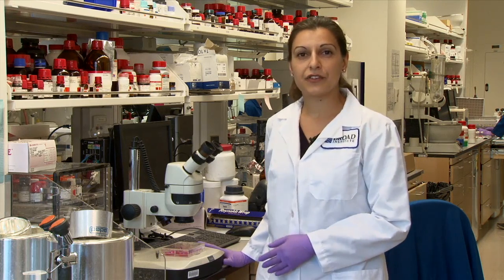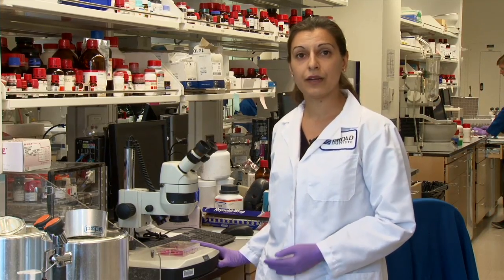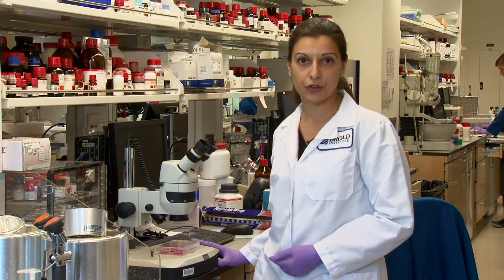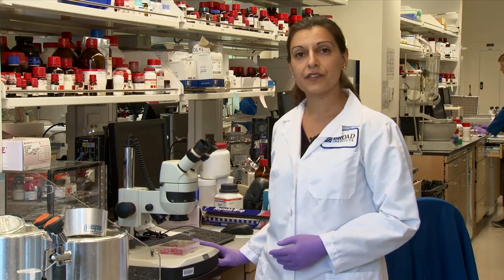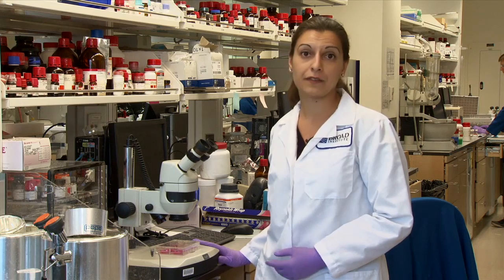Take a look at these images of living cells stained, and the assignment is to discuss the purpose of positive and negative controls in an assay like this, and also discuss with your classmates what a good potent drug would look like in this assay on these cells.